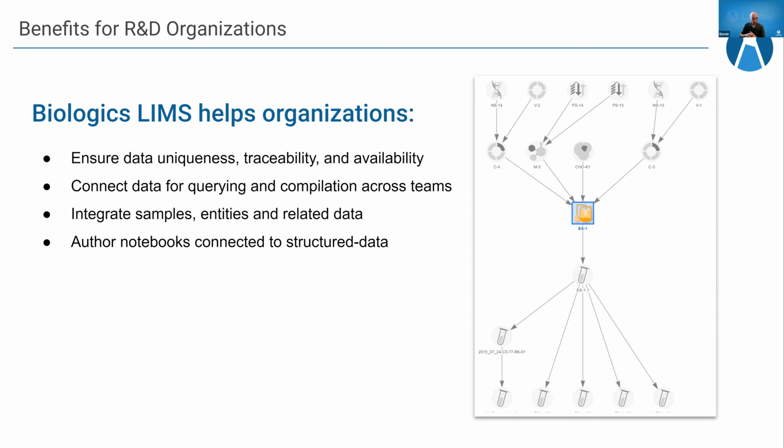And lastly, general exploration of existing data for project management or project planning is no longer so labor and time intensive. You don't have to check 5 different systems and dozens of files, perhaps in many locations, in order to accomplish those things.